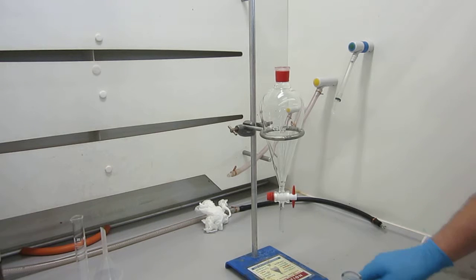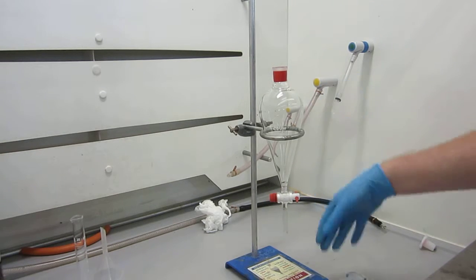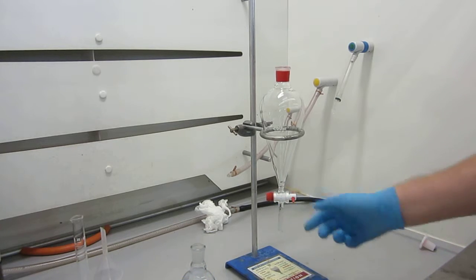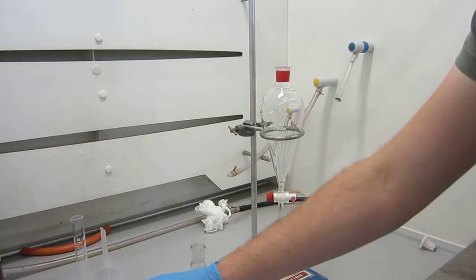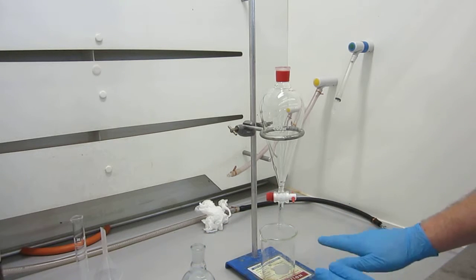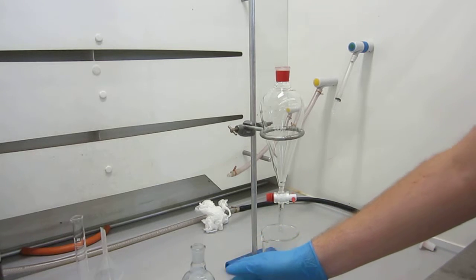with your separating funnel, check that the tap is closed, because you don't want to pour it in and have it all come straight out the bottom. So check that the tap is closed first and foremost, and then secondly you want to put something underneath just in case your tap leaks. So just in case it goes wrong, we've still got our product, because this reaction may have taken hours.